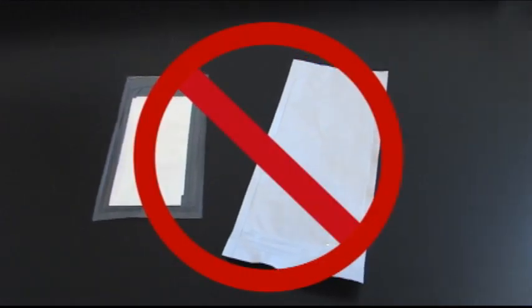The ASTM F1608 is a microbial integrity test for porous materials only. Foils and films cannot be tested with this method.